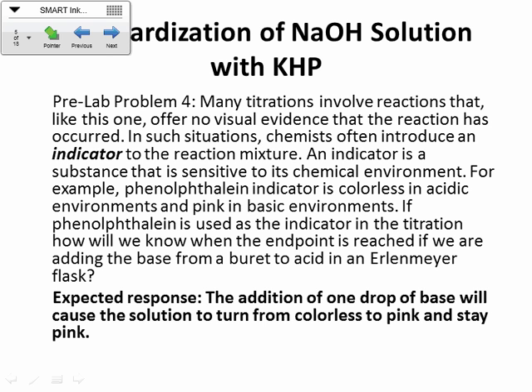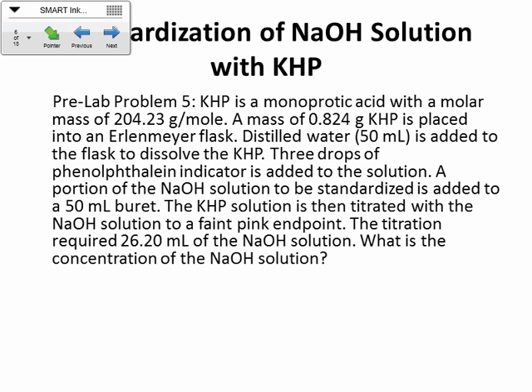And that's a good titration when you can add 1 drop and you can get it to stay. Now, we're not going to do the titration this way, but let's say that I was adding the acid to the base instead, okay? So I put the indicator in the base and I was adding the acid. Then what would I be looking for? Yeah, I would look for it to go from pink to clear, and that's how I would know that I reached the equivalence point. Okay?